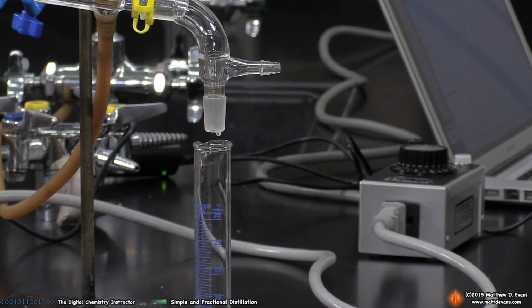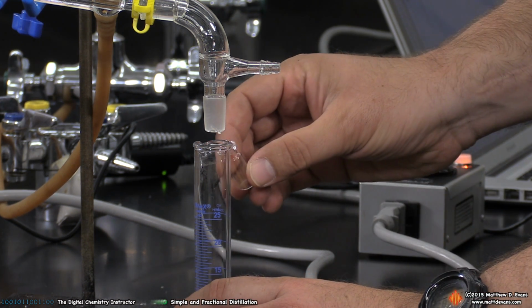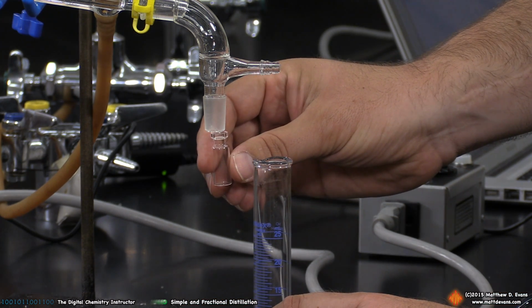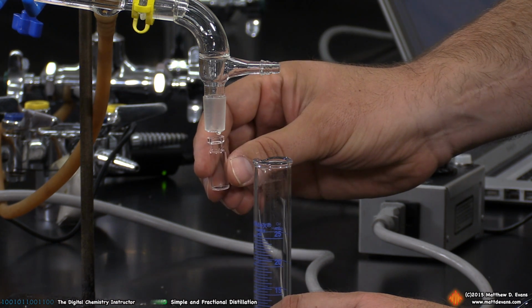All right, so I'm close enough to the 4 milliliter mark that I'm going to go ahead and take a sample in an auto sampler vial. So just temporarily move this to the side after the next drop here. And I mentioned earlier that we're looking to collect about, we're trying to make this little auto sampler vial about a third full is the goal.